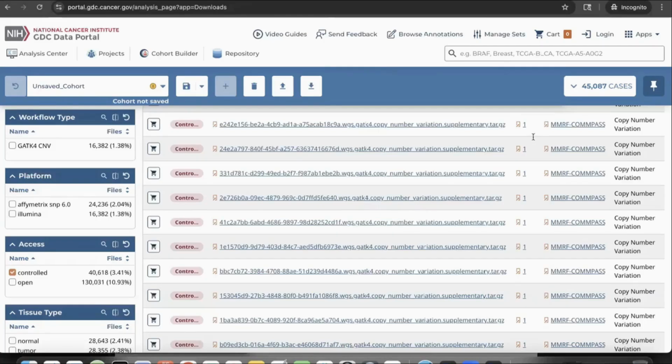And second, as mentioned, absolute segment values consider purity and ploidy. There is a lot of modeling, and normally the same data will result in multiple potential models, and one of those will be used to derive the segment you get, but it's possible that the model being picked is not the right model. That's why copy number inference is very difficult, and a lot of the experts want to do manual review of some of the samples with uncertain models.